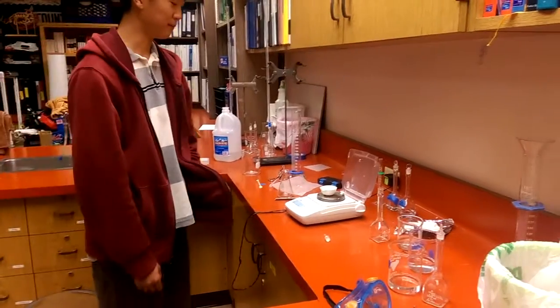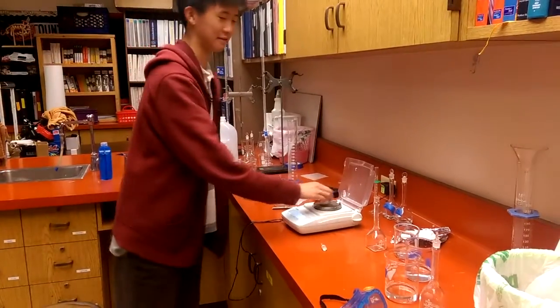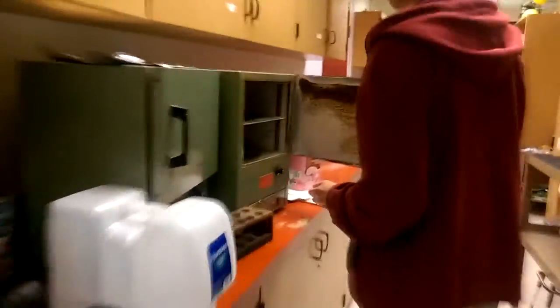If the substance you chose is hygroscopic, such as NaOH, standardize it using KHP. Mass and heat the KHP in an oven first. Put the KHP in the oven in 5-minute intervals and weigh them until the mass stays constant.